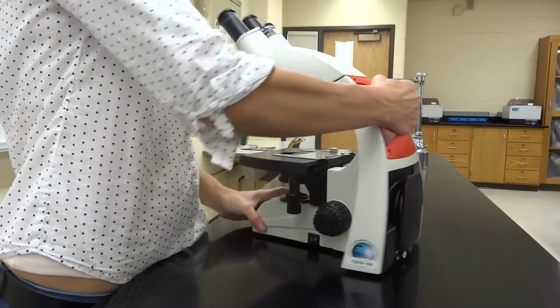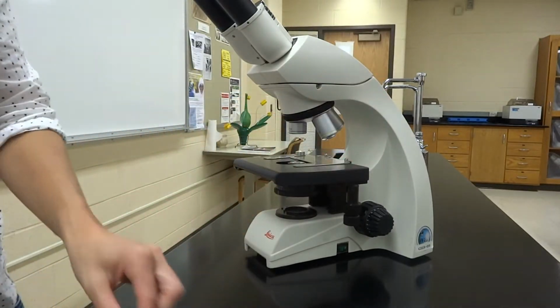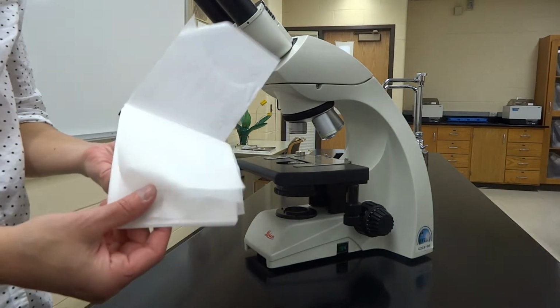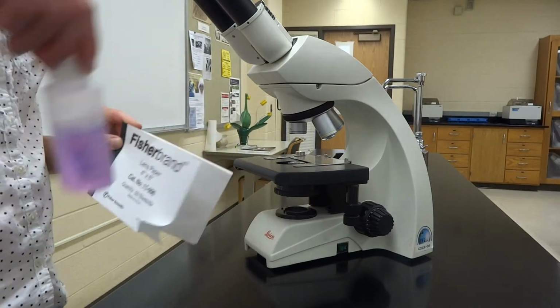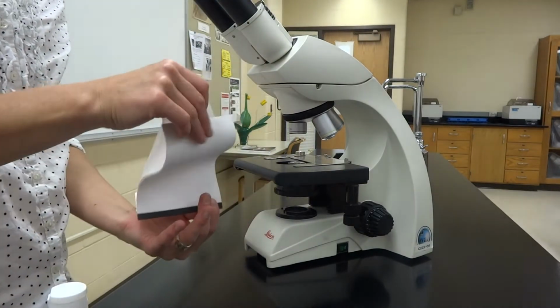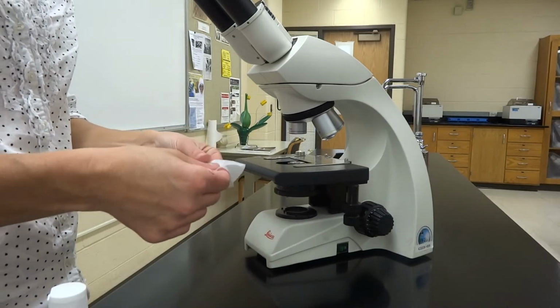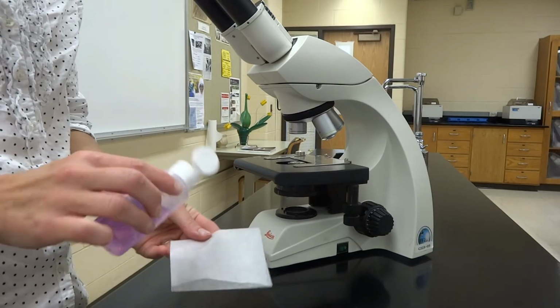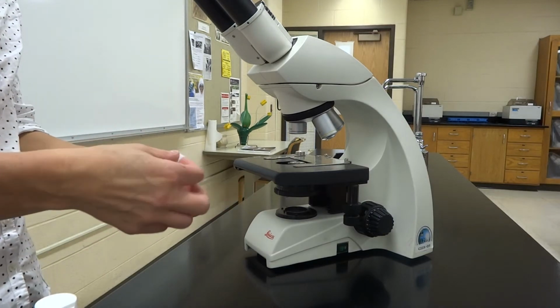And then one of the things, especially if we used anything wet, is to clean off the scope. The oils that are on your hands, your face, etc. can all hurt. So we have 2 things that we use: lens paper, which is what Liz has there, and lens cleaner. So with the lens cleaner, typically what I do is rip off some of that lens paper and put a little bit of the lens cleaner on the paper. It doesn't take much, okay? You're not cleaning a car. You just gotta clean a couple pieces of lens here.